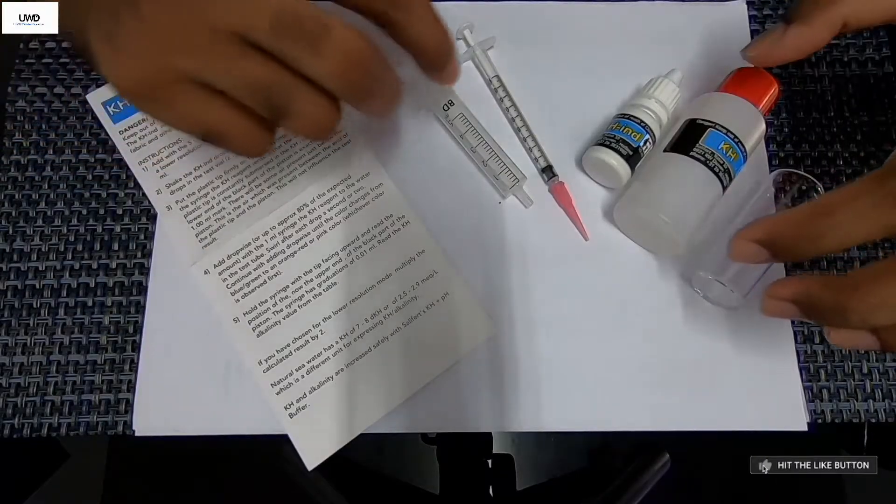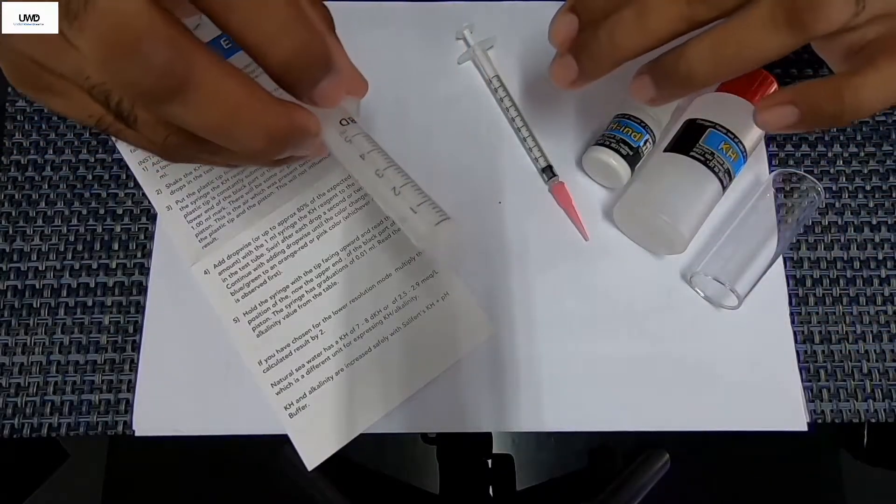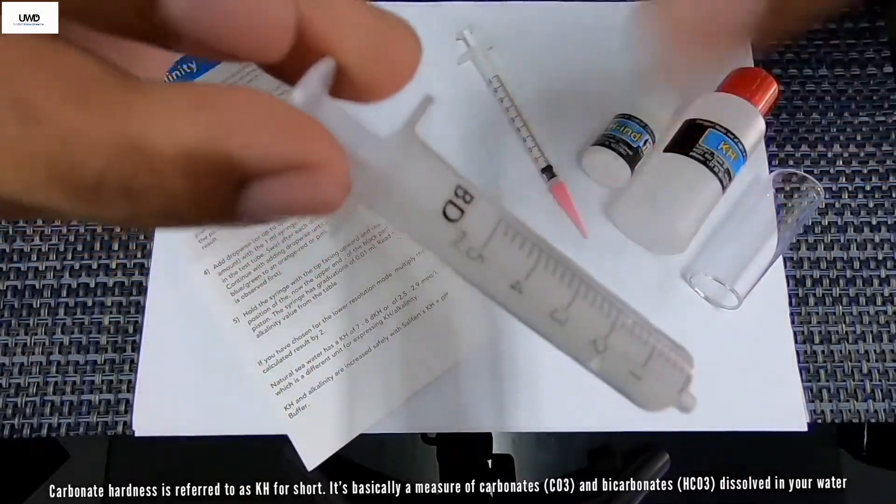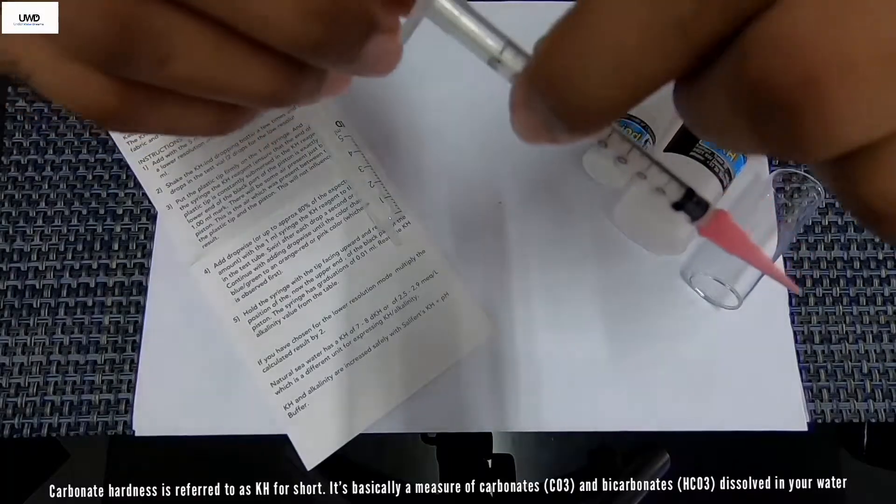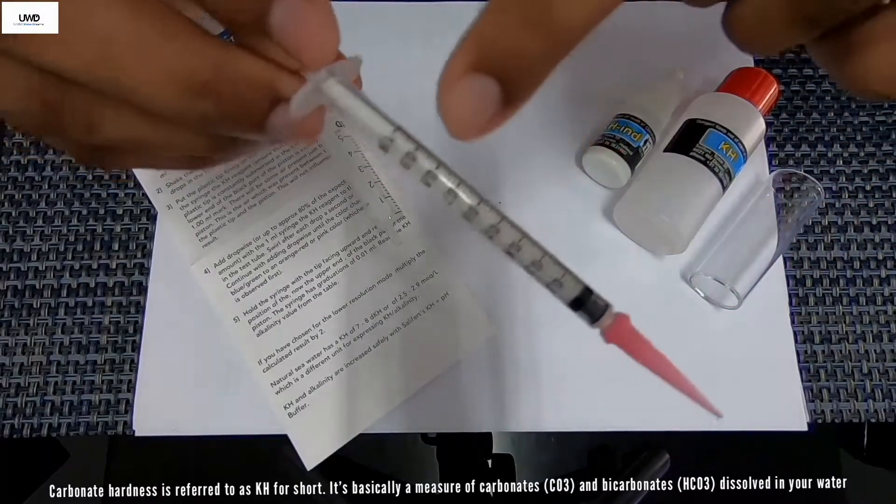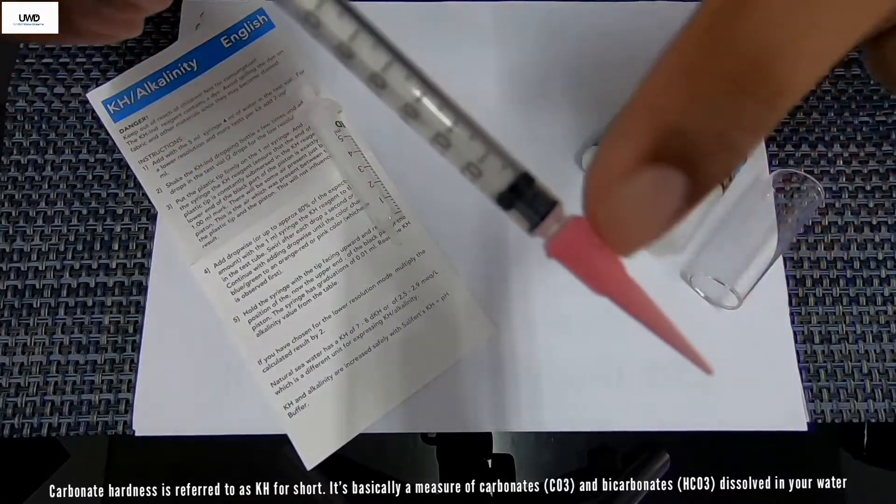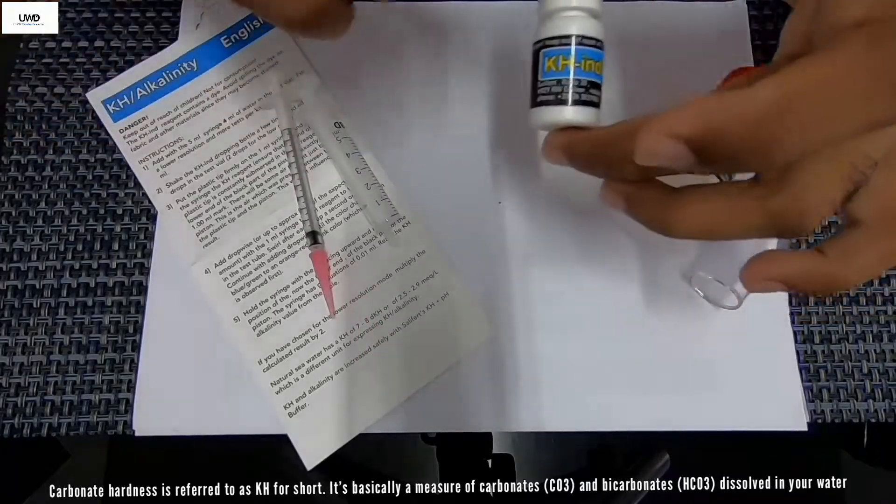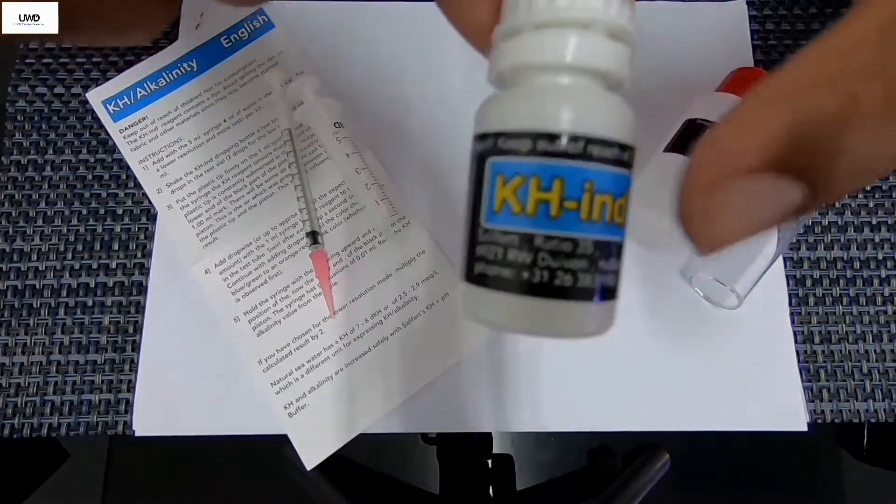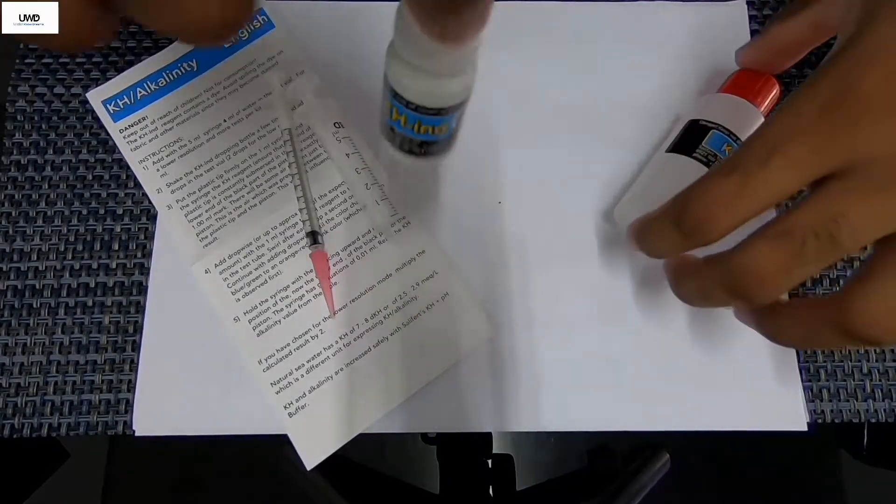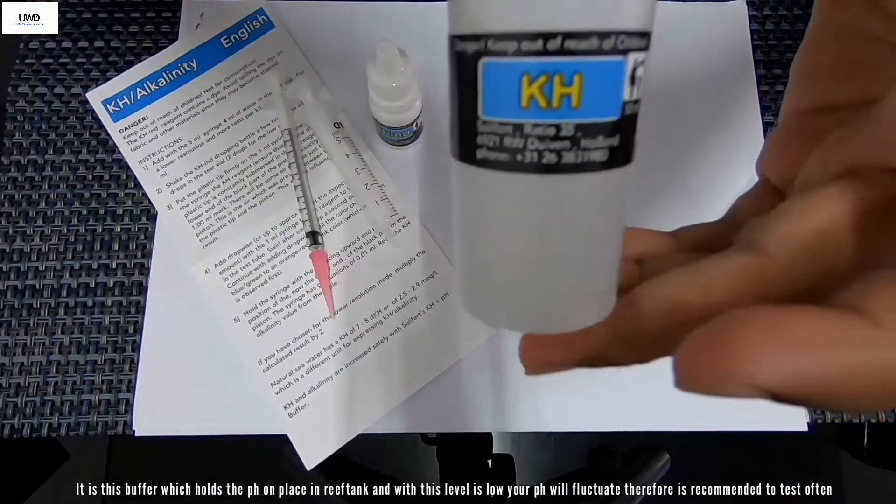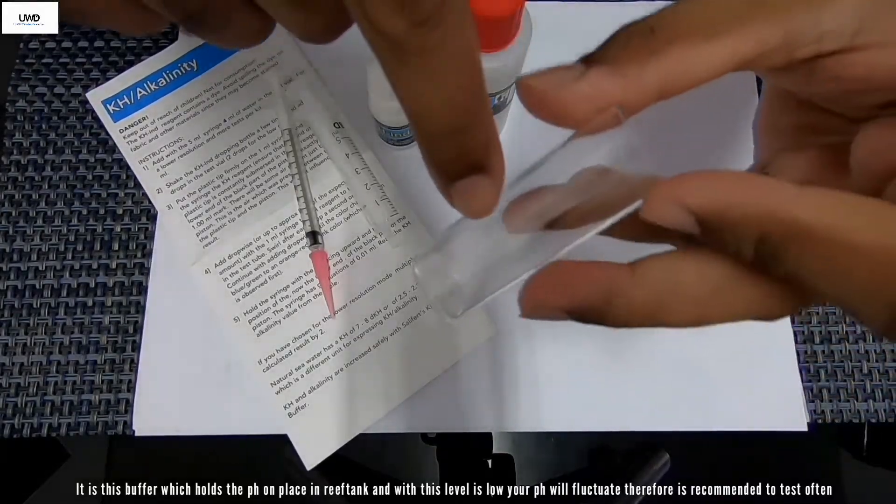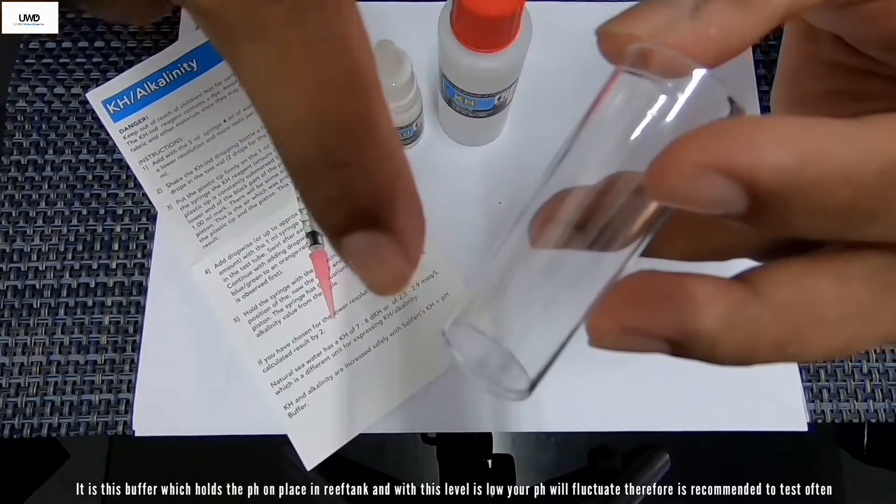There's two types of syringes: one is to draw tank water here with the 5ml mark, and the smaller, thinner one to draw reagent which is a 1ml mark with this pink color tubing nozzle in front here. There's a KH indicator here, the small bottle, and a big bottle, another one is the KH reagent also. And then the last one is your test vial, this is where you're going to be mixing up your reef tank water and all the reagents.